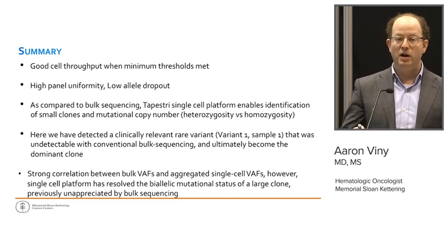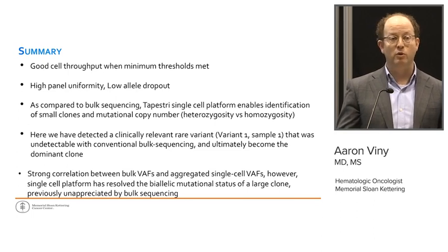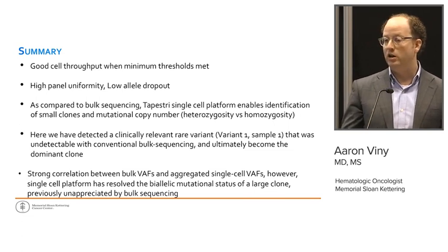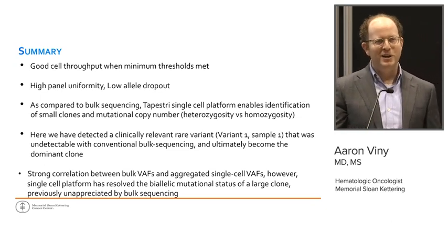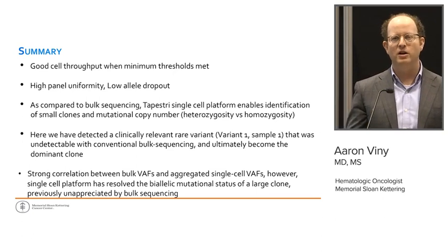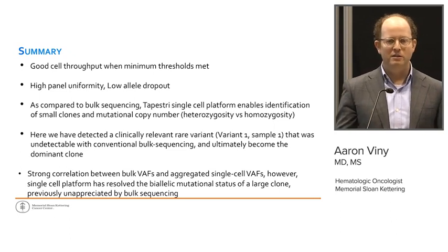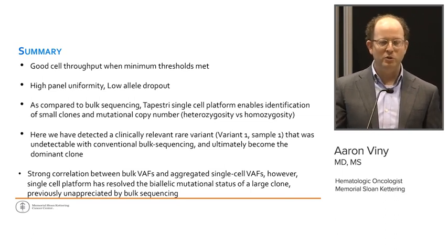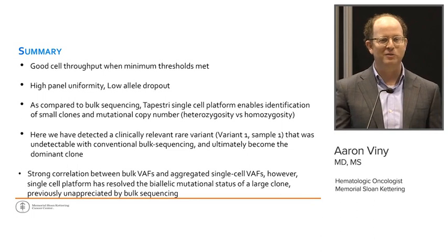We have the ability to determine zygosity in the mutant clones, which is really essential for appreciating the clonal polarity as these diseases' natural history changes. But we were able to detect a clone that exists in 4 to 5 cells of a patient's leukemia, a 0.07% clone that really has tremendous clinical relevance in this particular case. So we were joking when we looked over this data that both we and Mission Bio got very lucky in selecting these patients because this data is just, it's just killer.